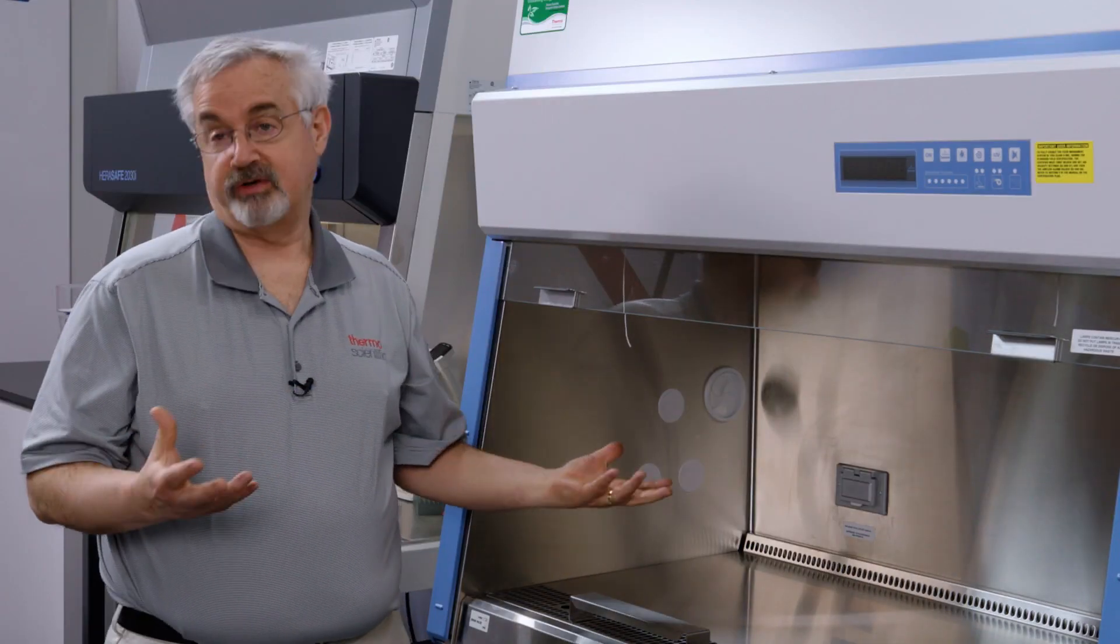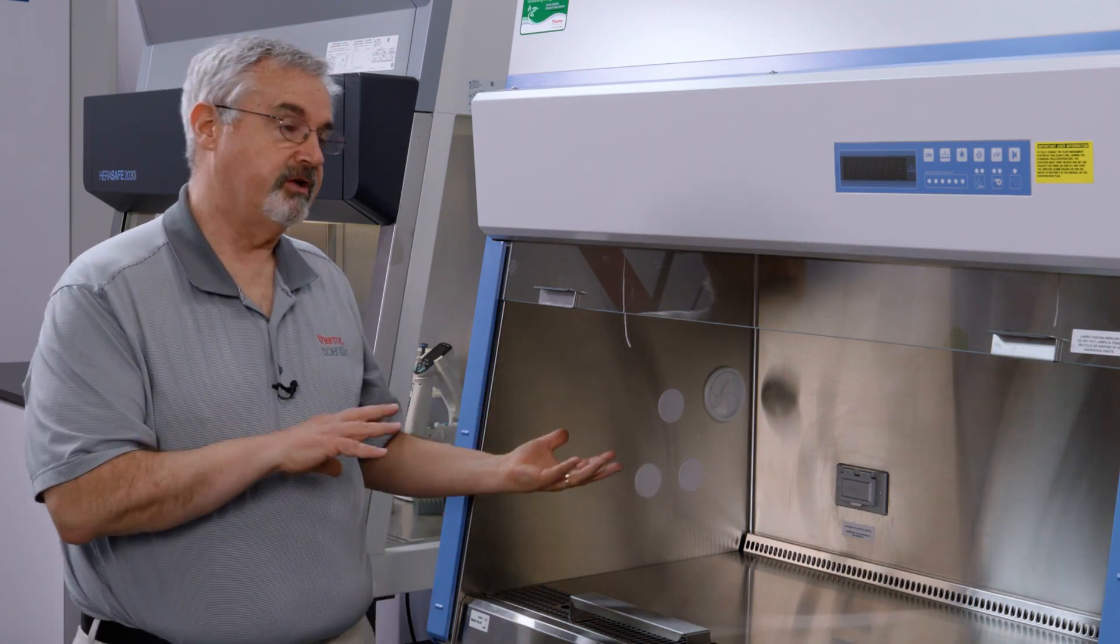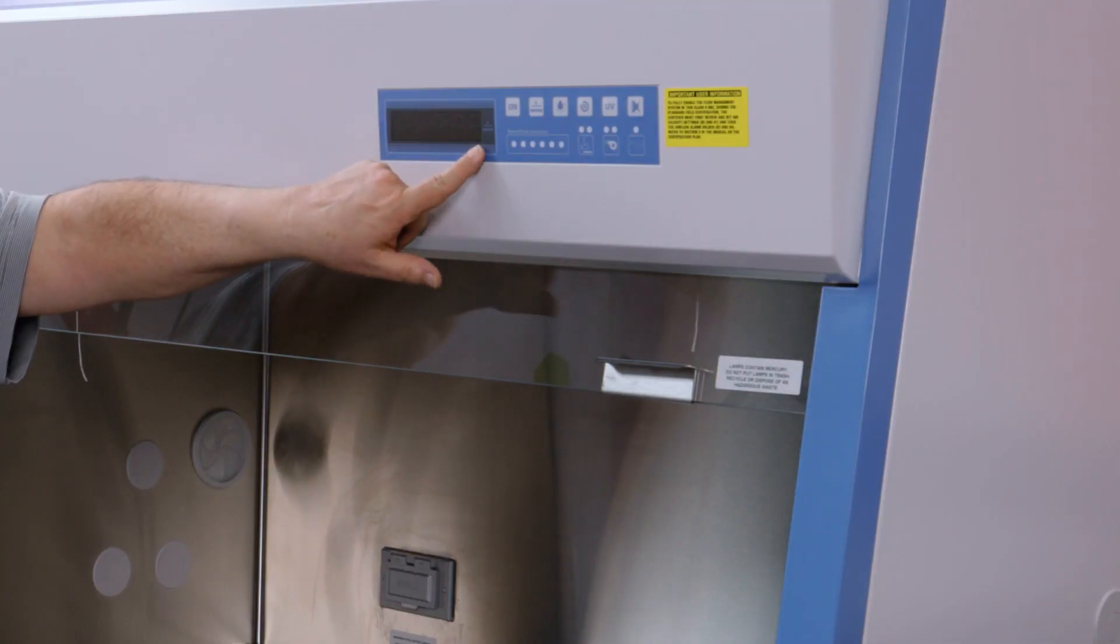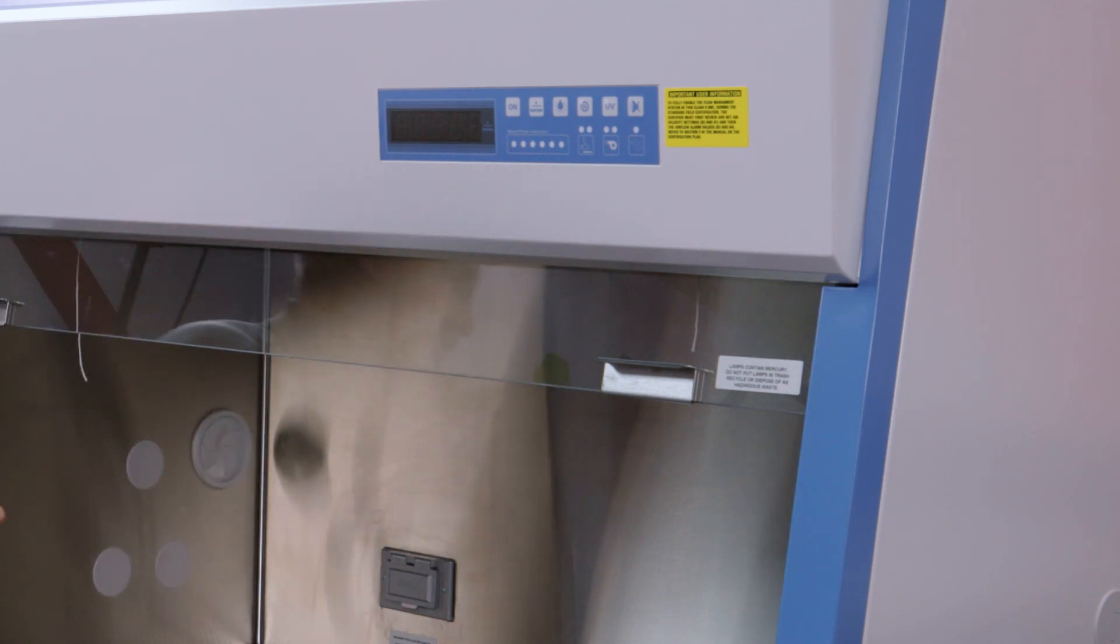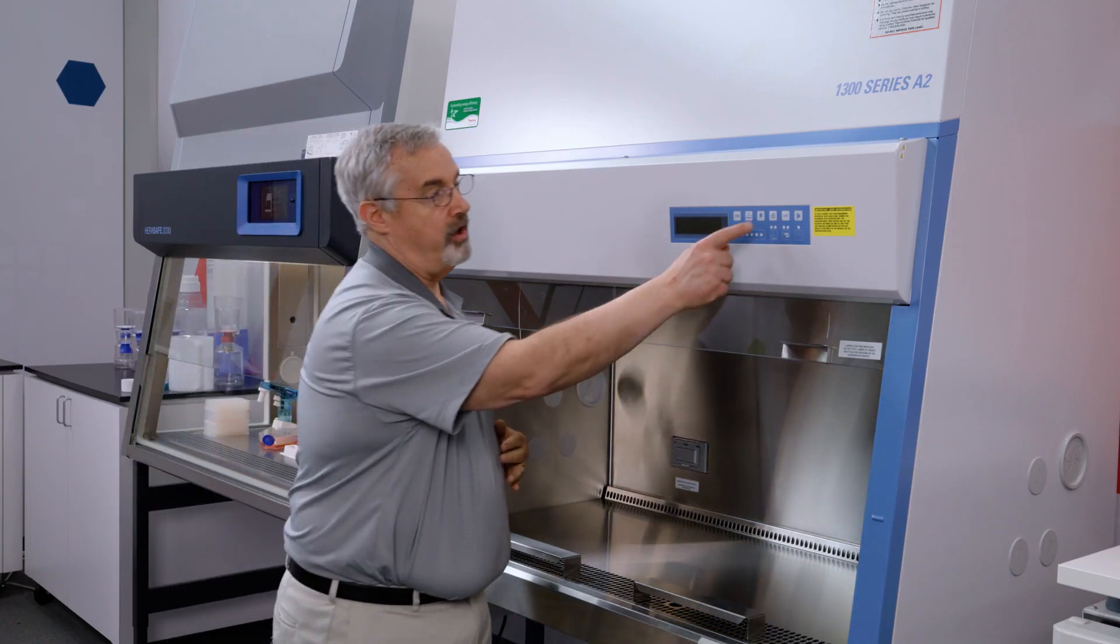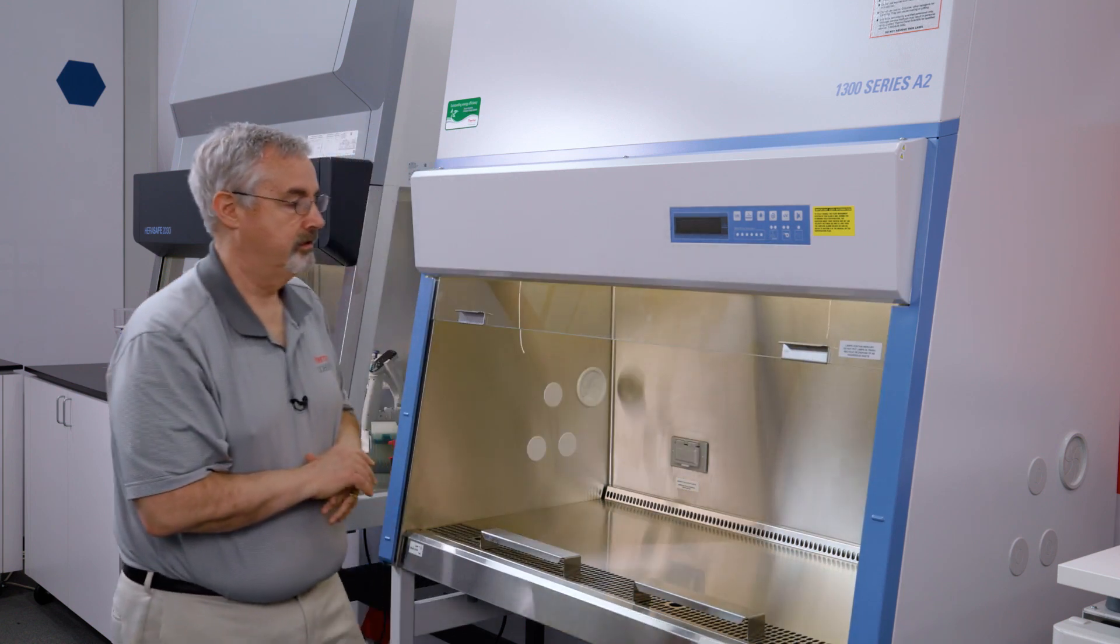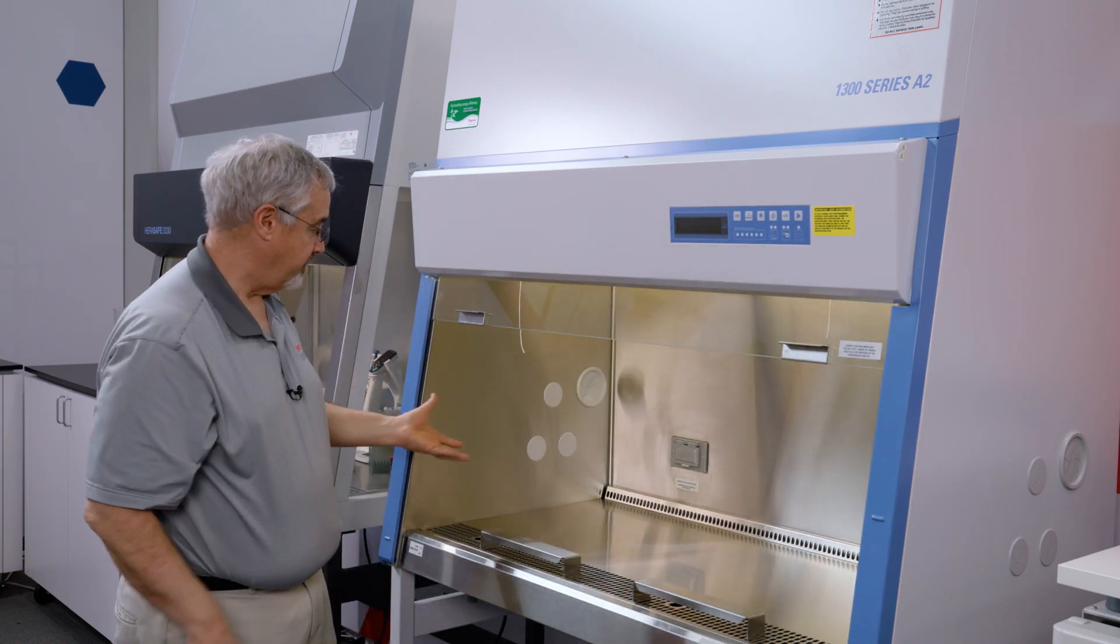So we've installed the drain valve. We've plugged in the unit and we can see the unit is powered because we have this green indicator showing that there's power going to the unit. We're going to turn on the work light and now we can see the inside of the cabinet.